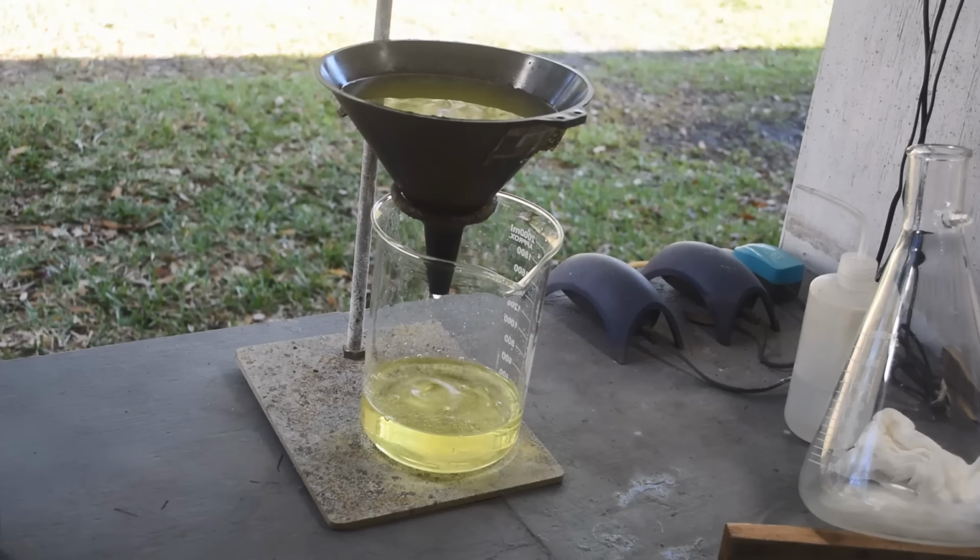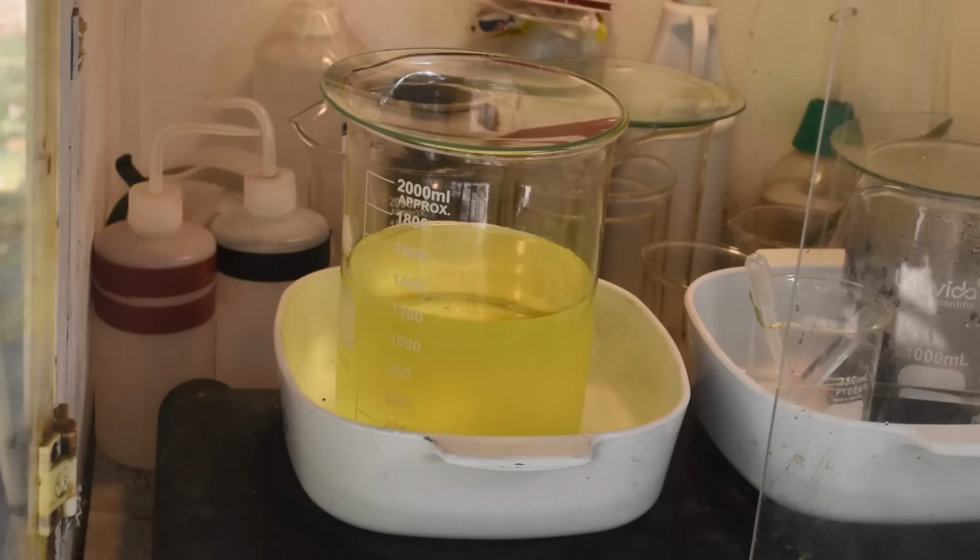It's going to take forever, but at least it's coming through nice and clean, so I don't think I'll have to filter it more than once. So there is that. Okay, it's just a waiting game now.